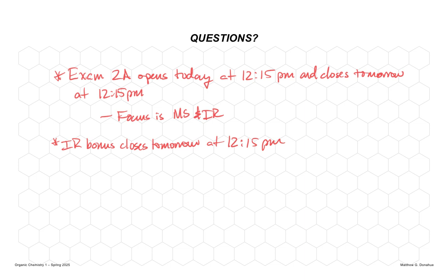Within that file, again, there's the different functional groups that we talked about. And what I'll show you in class today is how you want to interpret these spectra. Really, the thing with IR, it's visual. So you're looking for the way signals look to associate them with a functional group. And if a signal is absent, you can rule out that functional group being present. So that's the key part. Any questions before we get going?